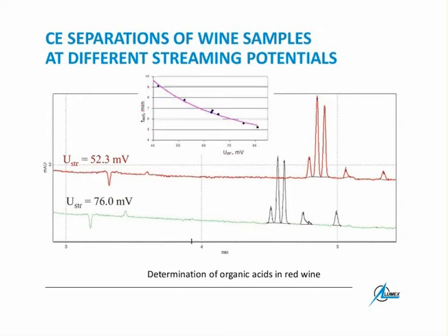And if you measure the streaming potential from the very beginning, you are able to say that, no, now I should not make the analysis because my capillary is still contaminated. I should rinse it more. And you understand, of course, that everything is implemented in the software, and what we are talking about now, the decisions of the software and the decisions of the operator, is done automatically.